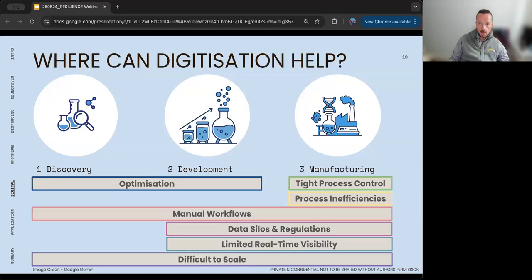And then there's also the siloing of data. So between the systems or indeed the different teams that are involved, data needs to be brought together in order to learn from the process or experiment that you've run and move it on to the next iterative improvement.